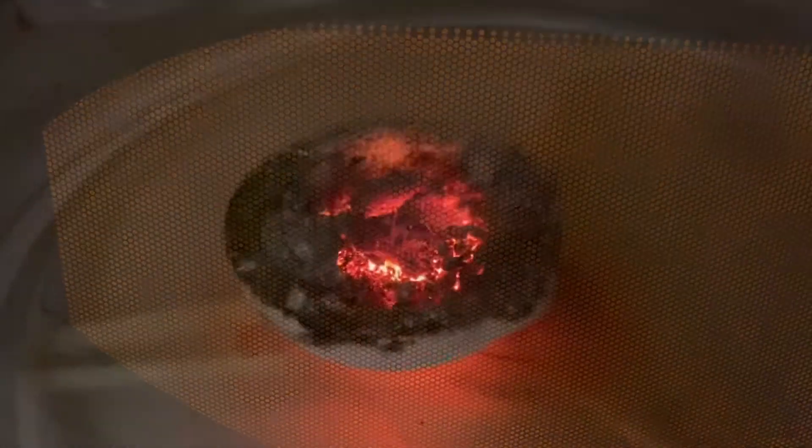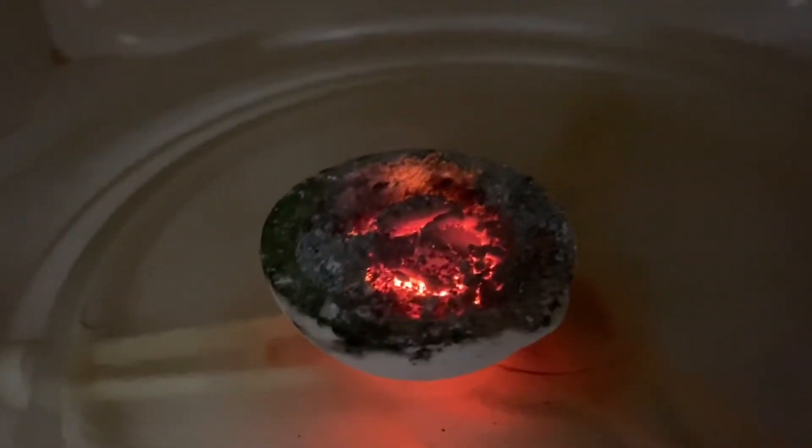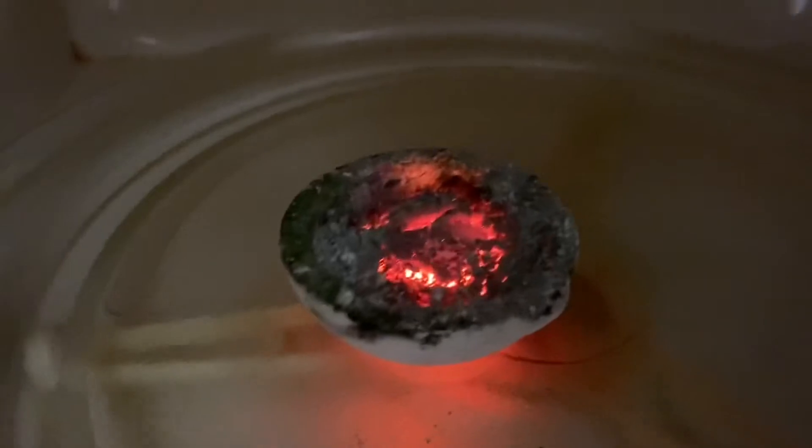Yeah, you can see the mixture is starting to become molten now. All right, here you can see the extreme heat of the mixture. We're going to let that obviously cool down a bit.